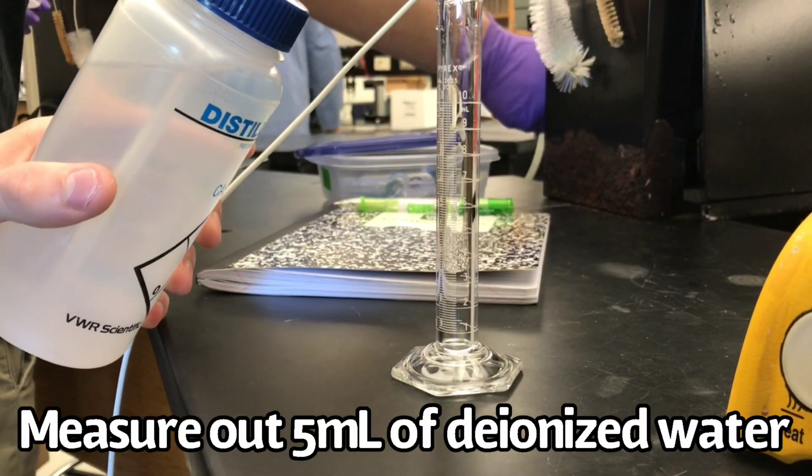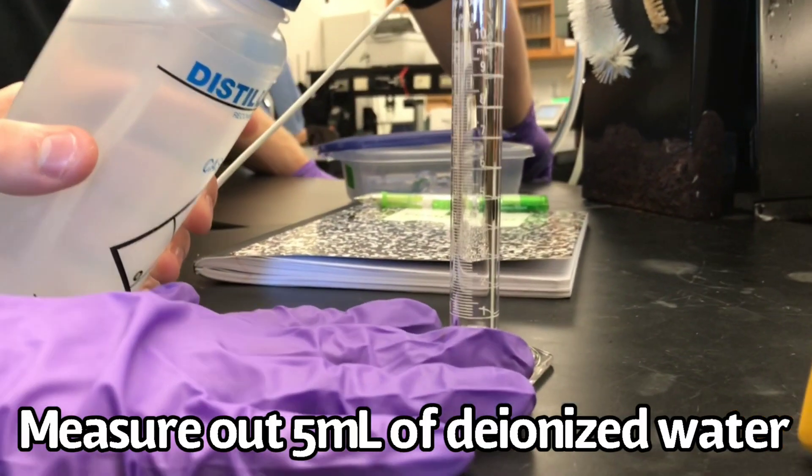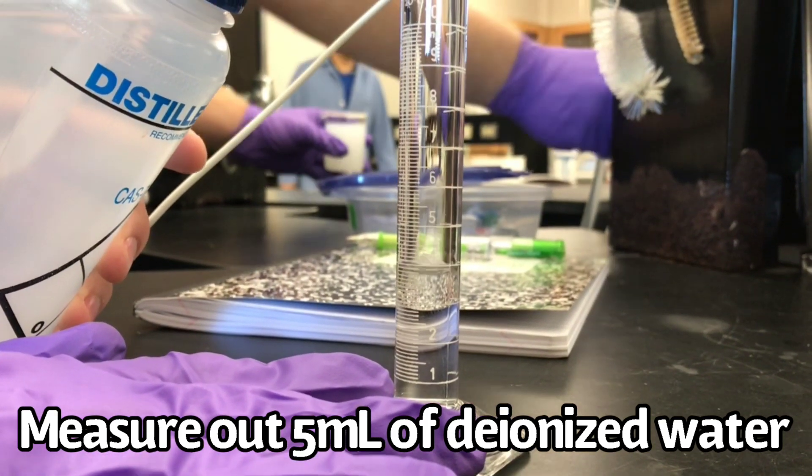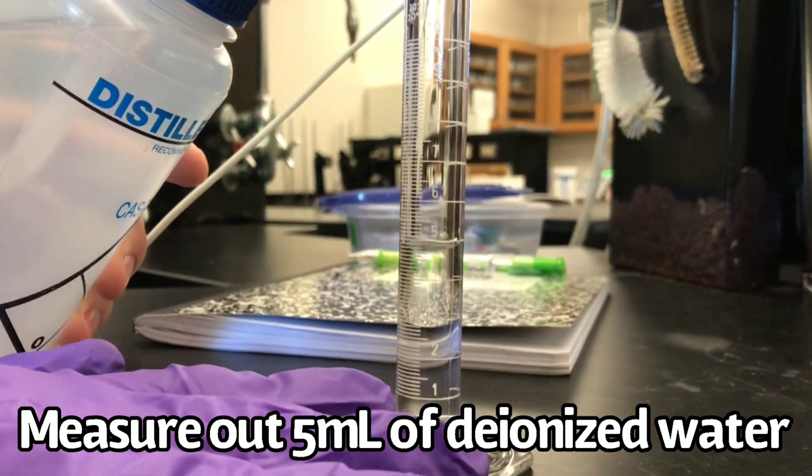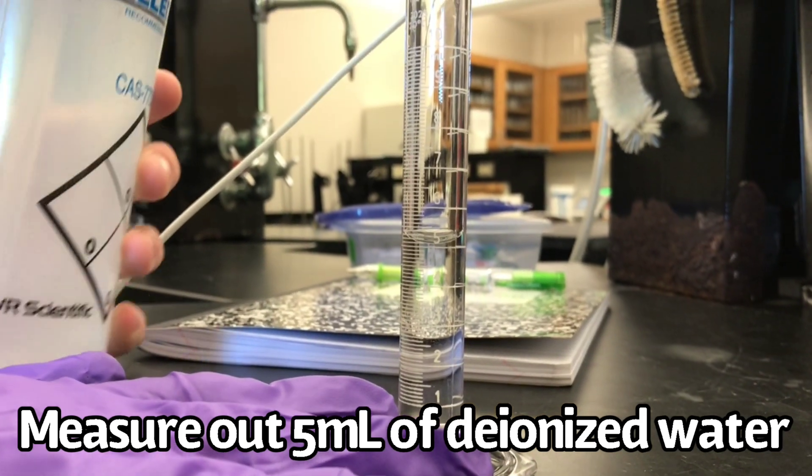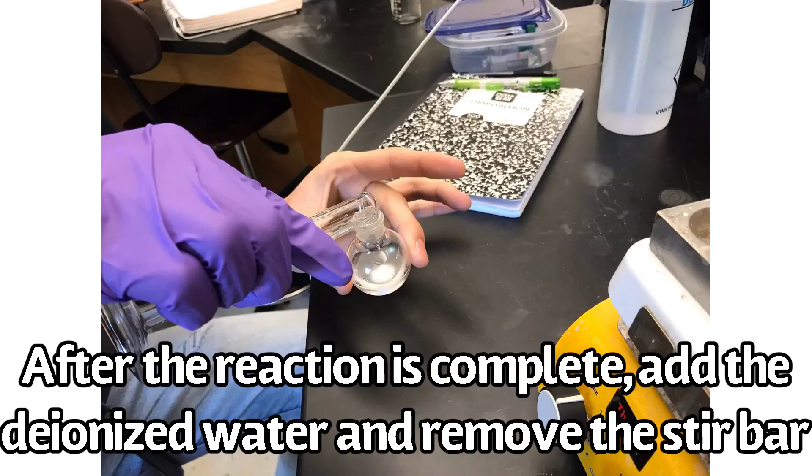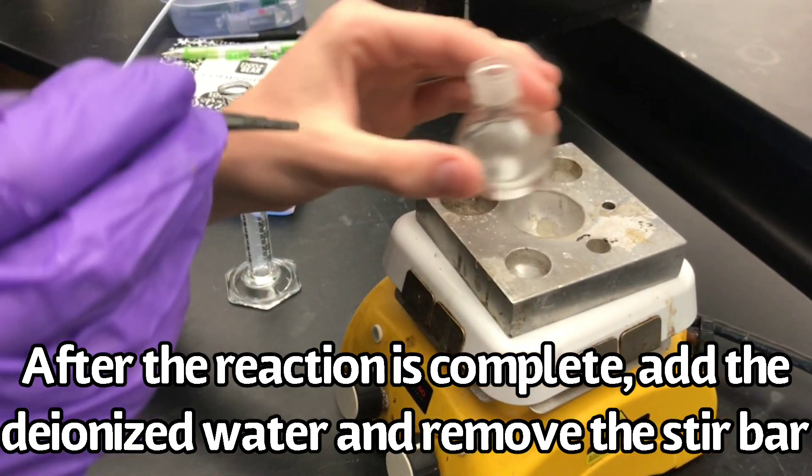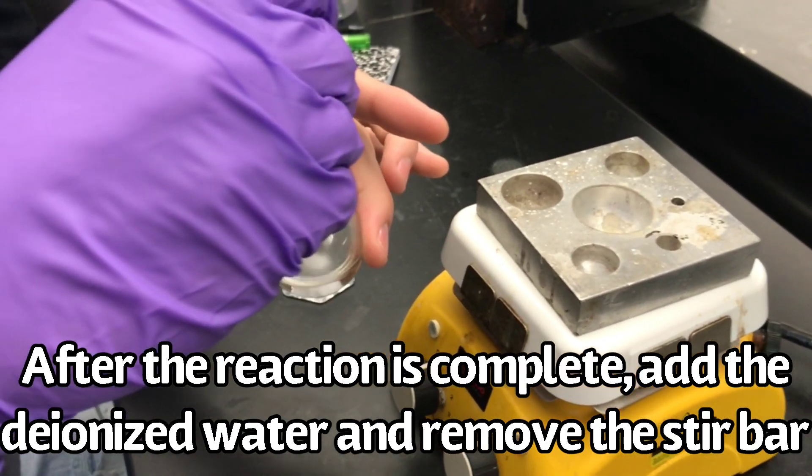While the solution is stirring, measure out an additional 5 milliliters of deionized water. Once the reaction is complete, add the 5 milliliters of deionized water and remove the stir bar.